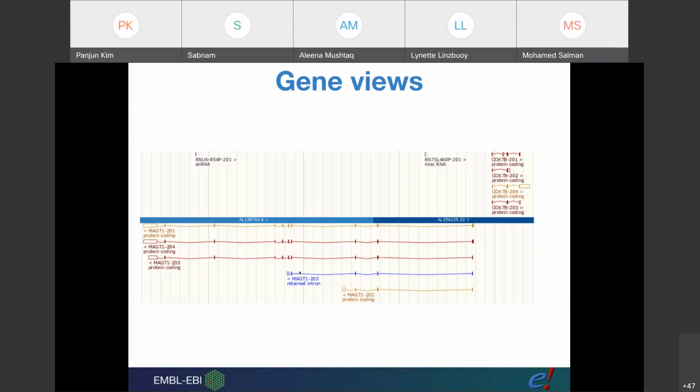A few more things that we can learn from this image on my slide. I wanted to mention exons. So exons are shown as boxes, and these are over here and over here. And as you can see, they could be empty boxes. Empty exons are non-coding, which means they're not translated, they're only transcribed.